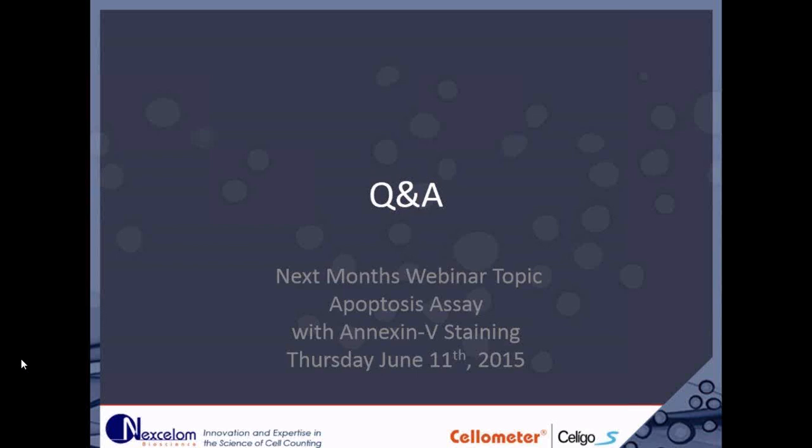All right, so I'll just give people a minute here to put any questions in. Sarah, I just want to remind people that where I see the viability assay used frequently is, again, they've gone through bright field imaging with proliferation experiments, and then at the end they want to just get an assessment of the viability. So this is a real easy assay for anybody to just tack on any proliferation experiment they have going on.